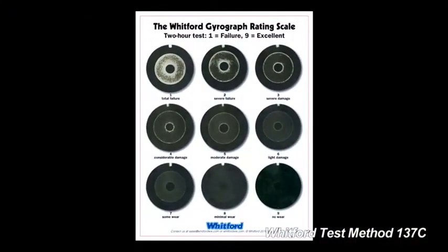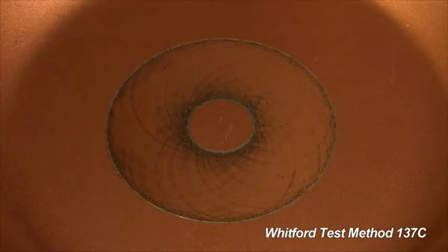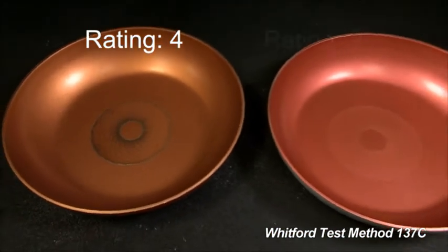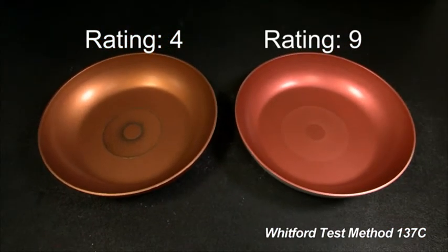Damage, if any, is measured according to nine categories. In a previous test, this pan rated only a four, whereas this pan rated a nine.